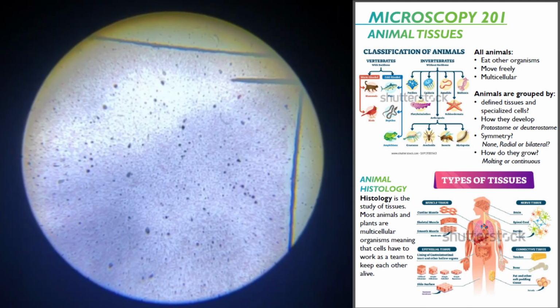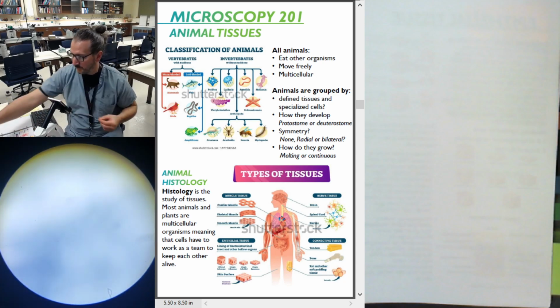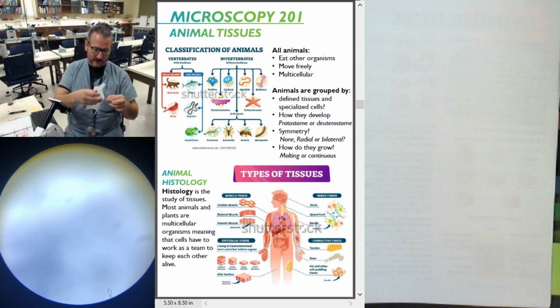So what I'm going to do is pull this out. I'm not as picky with my slides as I am with lenses, because lenses are magnifying. They magnify anything that I clean it with. So I'm actually going to take a chem wipe, a little tissue, drag across. Yeah, it looks pretty clear.